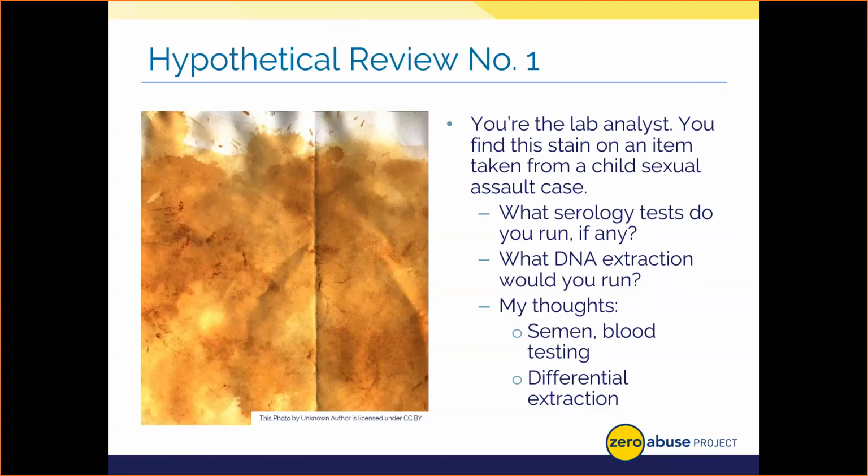I also feel confident in going through the serological tests and then doing DNA simply because there's a large amount of stain here and it looks pretty concentrated. If it was too dilute or I only had a little bit, I'd probably just go straight to DNA.